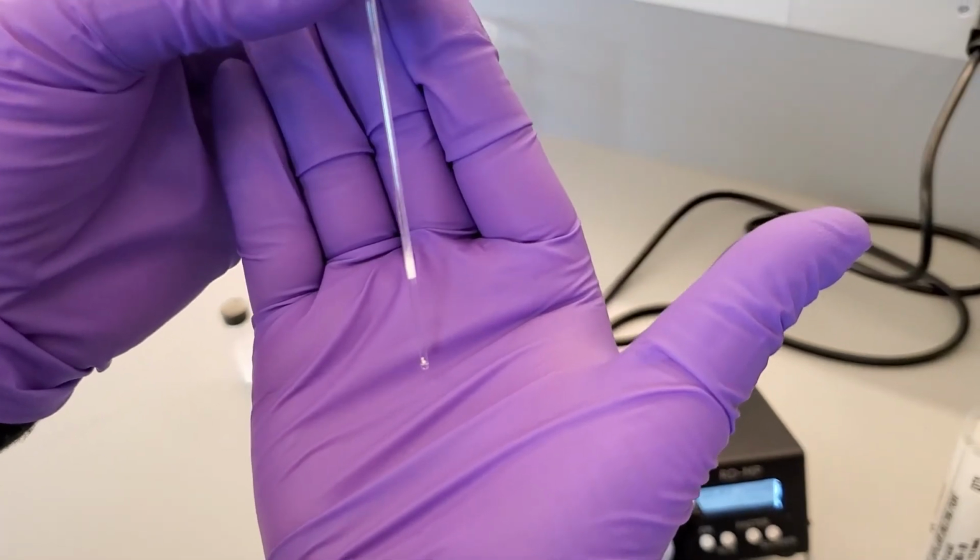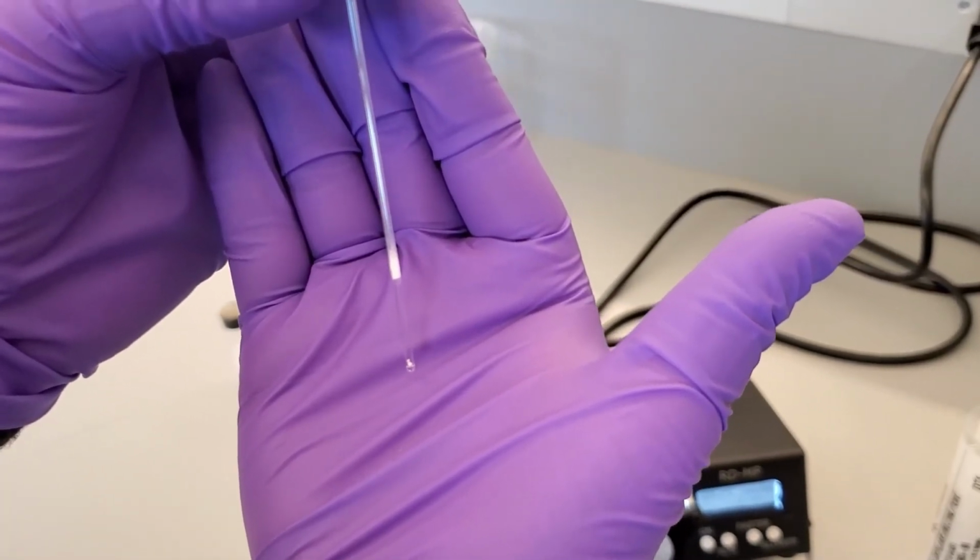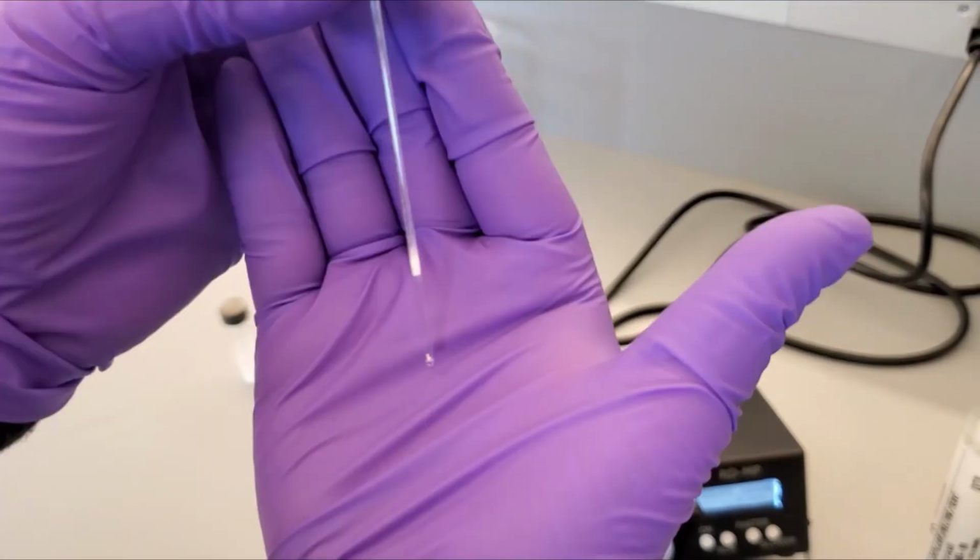When we take out the melting point tube, we notice that our product has deposited on the cooler upper portion of the tube. Some sources for chemical properties of isoborneol include sublimation in parentheses next to the melting point temperature to indicate that this may happen.